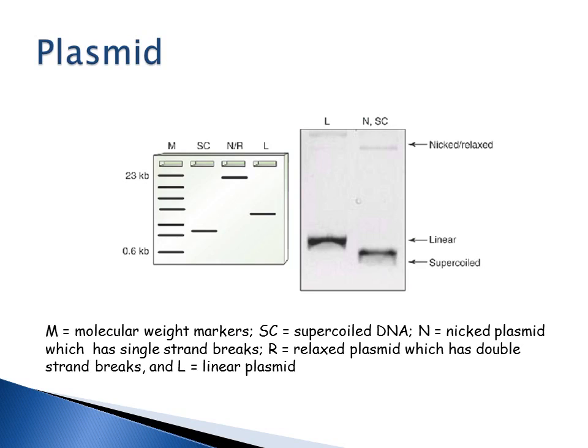So we talked about plasmids, these circular pieces of self-replicating DNA. A lot of bacteria contain plasmids because commonly plasmids have genes that bacteria need, such as antibiotic resistance genes. So if you wanted to isolate plasmids from a bacterial specimen, you can do a plasmid prep.